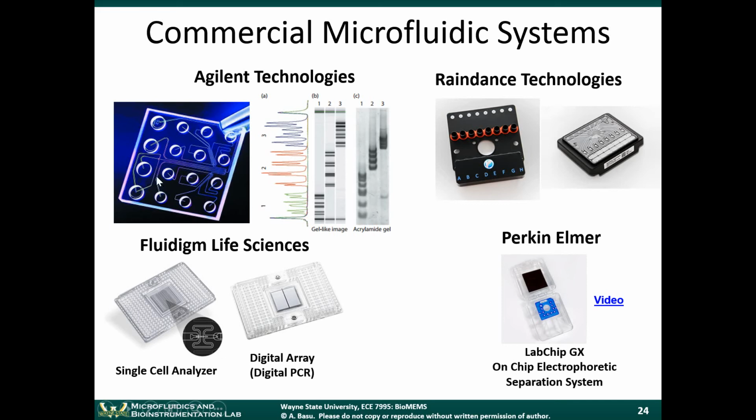These types of chips are used for diagnostics. The picture here shows just the microfluidic chip. These chips are typically consumables because they're so small they can be thrown out afterwards. They are put into a larger desktop-like device, which reads the chips, performs the assay, and so on.